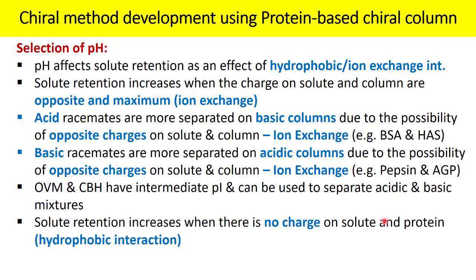Solute retention increases when there is no charge on solute and the protein, where the hydrophobic interaction dominates. So when can the hydrophobic interaction dominate? Tell me: when there is no net charge on the protein and when your compound is also non-ionized, hydrophobic interaction.